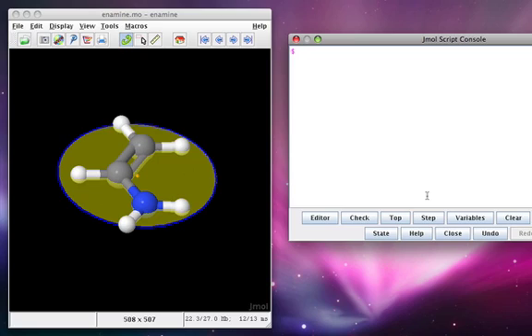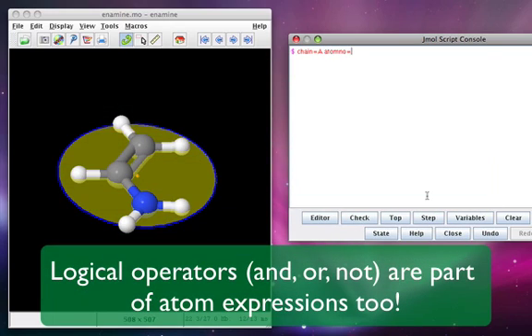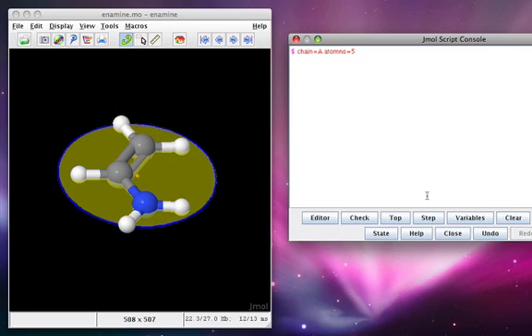There are two ways to specify points in JML to which objects can go or from which they can issue: coordinates and atom expressions. Atom expressions are the same as the select command's parameters — things like chain equals A, or atom number equals 5. Those are atom expressions, and they return a set of atoms on which the next command will act. For draw commands that specifically go to a single point, if an atom expression returns multiple atoms, the geometric center of that group of atoms will be the point that the command sees.